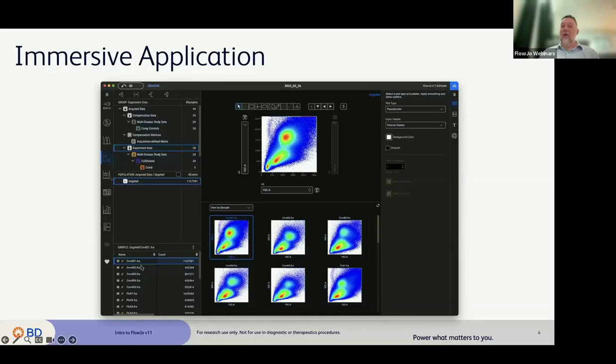So down here we have all of the samples that are in the group you've selected, and we're looking at ungated events in the graph window. So all of this is contextual. This controls what you're looking at and what you're running operations on. There are groups up at the top that are hierarchical, right? You can have indented groups that are subgroups of each parent group.